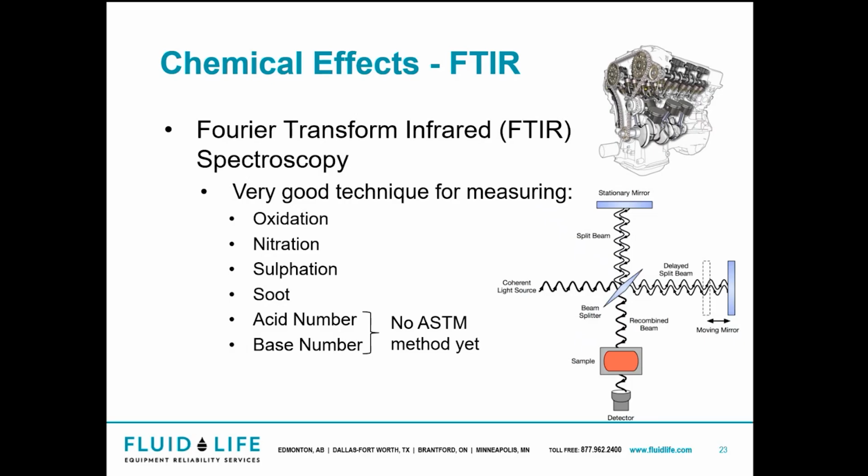FTIR is really good for measuring any of the oxidation, the NOx, the SOx, and the sulfation, soot, and acid and base number. Now, typically we're going to see this more in engines, and obviously engines are not lubricated with grease, but we can use FTIR. What it does is measure the absorbed light energy at specific wavelengths to determine what elements and what quantities are present in a sample.